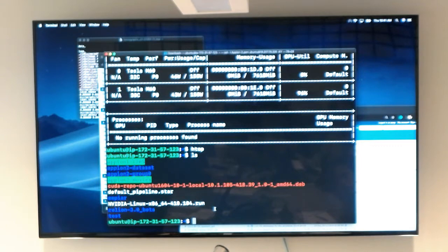And for efficiency, so that you don't have to copy it, you can always make symbolic links back to the raw data. The advantage is if you're doing several different runs and you want to separate them, you may want to create separate folders because you may be dealing with different packages, different complexes, etc.